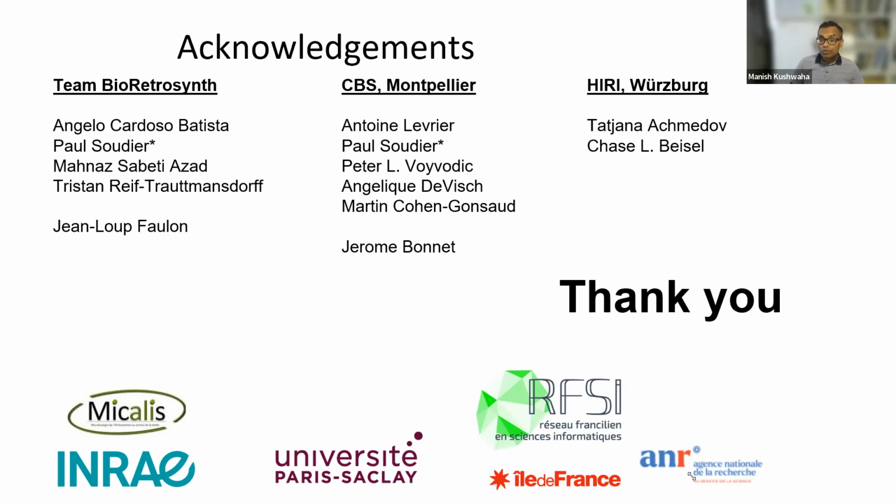So in general, we do see a lot of variability from batch to batch, from individual to individual. In a previous work, in which Paul and Angelo were both involved, done by postdoc Olivier Borkowski in the lab, they were looking to optimize buffer compositions.